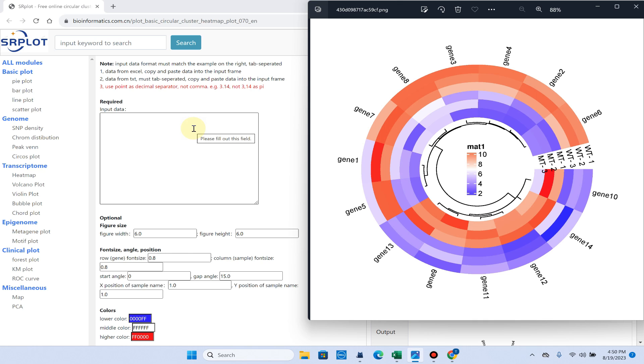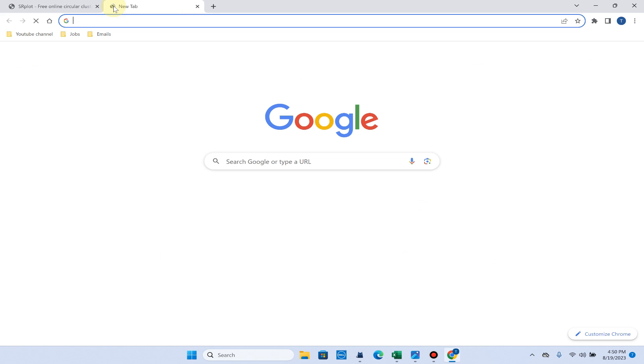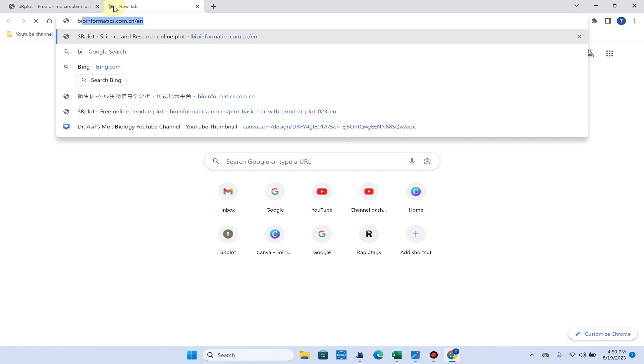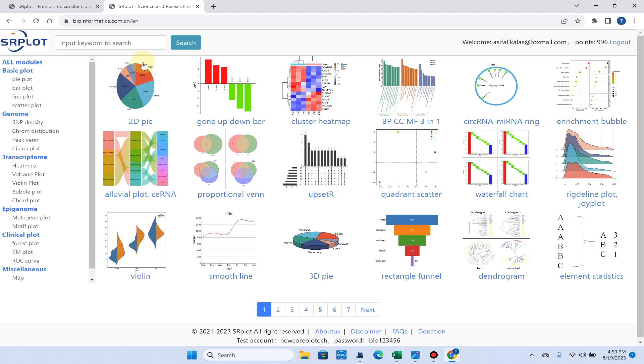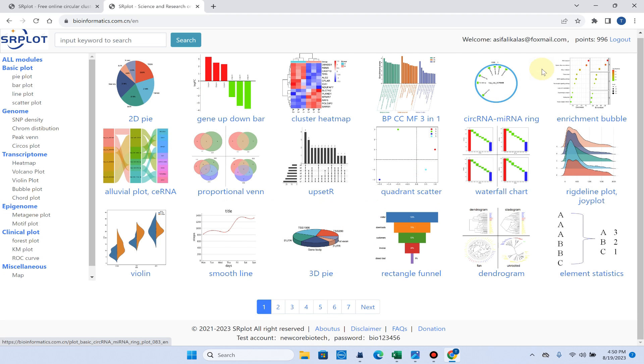Before I go into the details, let me show you how you can access this website. First of all, you can go to bioinformatics.com.cn/English. When you click on this, it will need you to log in first and it is totally free to log in.